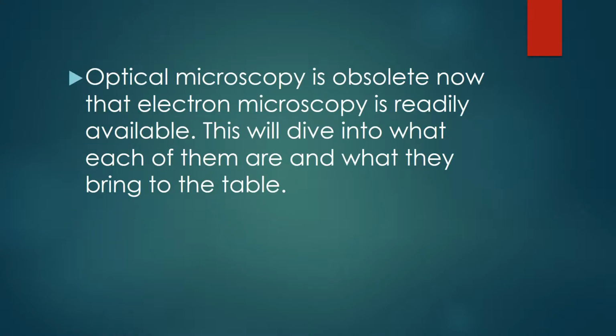Optical microscopy is obsolete now that electron microscopy is readily available. This will dive into what each of them are and what they bring to the table.